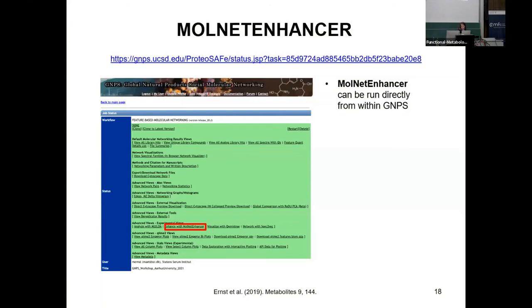MolNet Enhancer can be run directly within GNPS. Before running it, you also need to do in silico structure collection. As MolNet Enhancer is set up on GNPS, it accepts in silico structure input from network annotation propagation. So before starting MolNet Enhancer, we also need to run an in silico structure annotation through network annotation propagation.